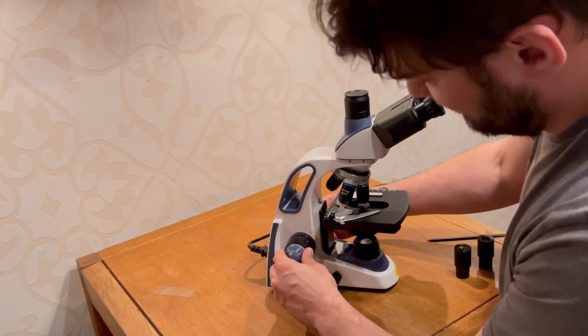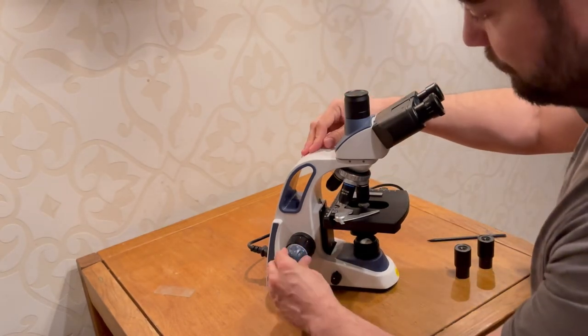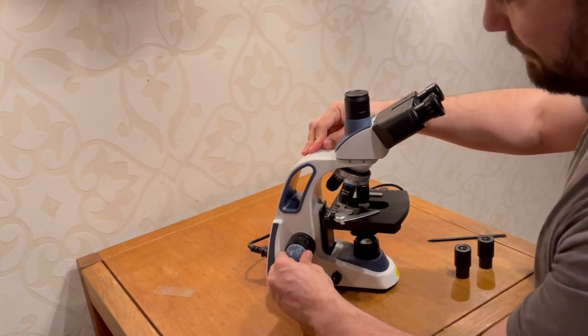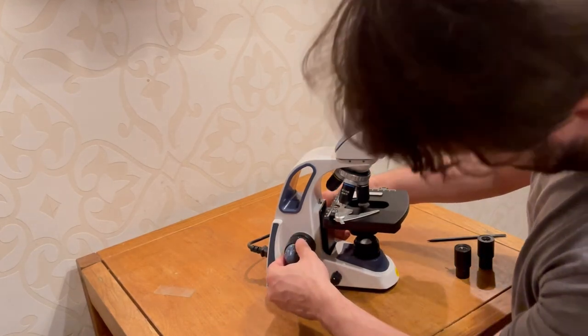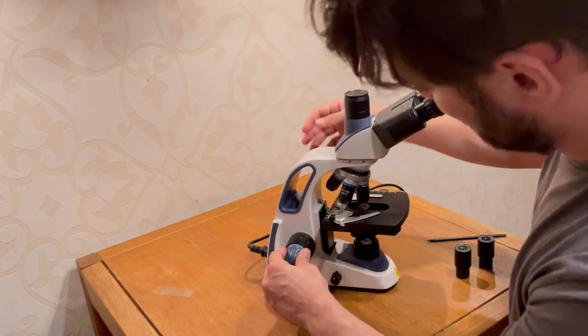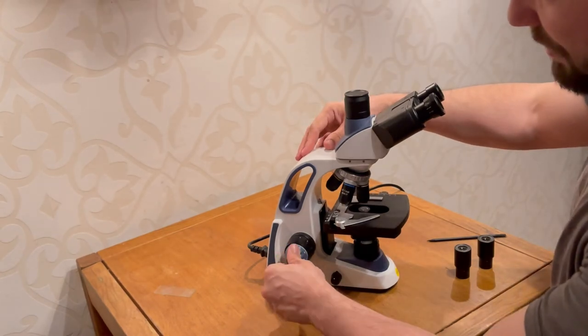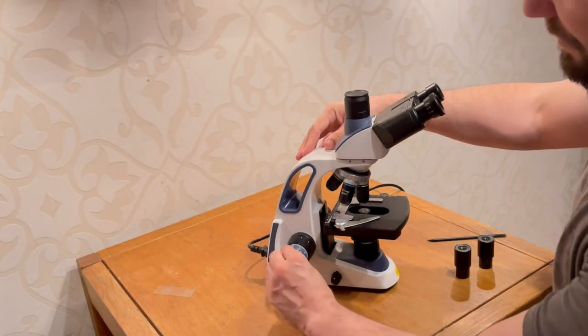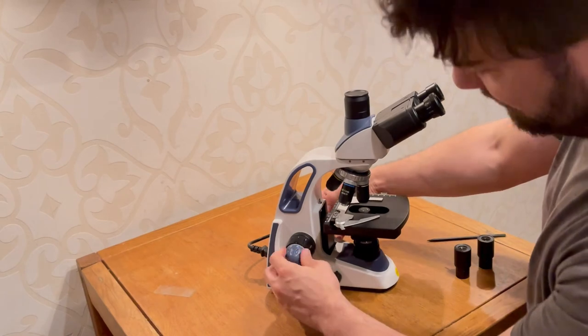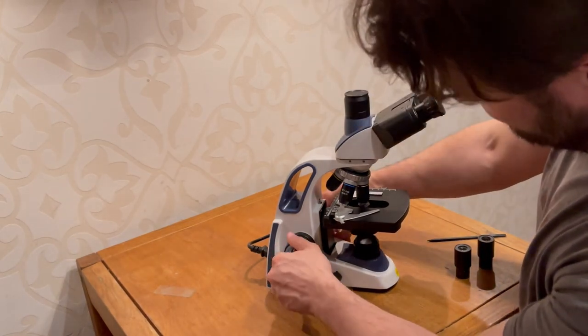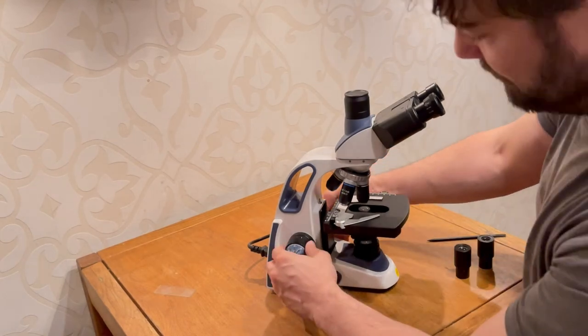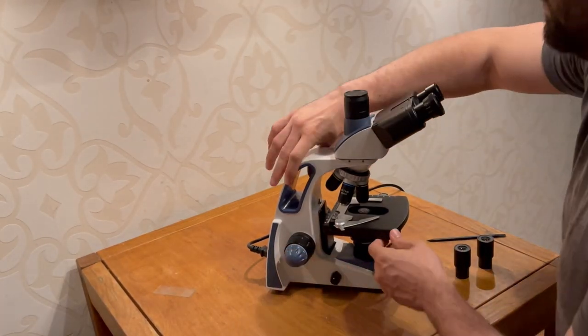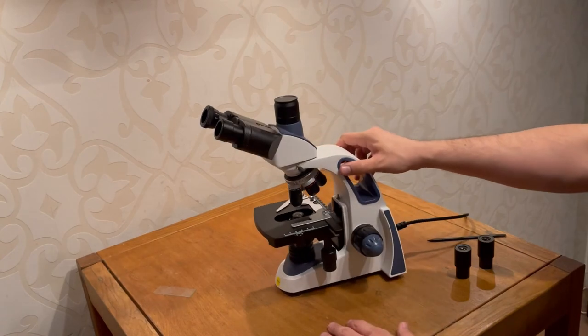And I think, actually, it's sometimes, when you rotate it, it actually grabs this one, and it goes like that. I don't know if I could show it to you. See? So, this is a bit not okay, I think. See that? This is not fine. I mean, it's quite terrible, I would say.